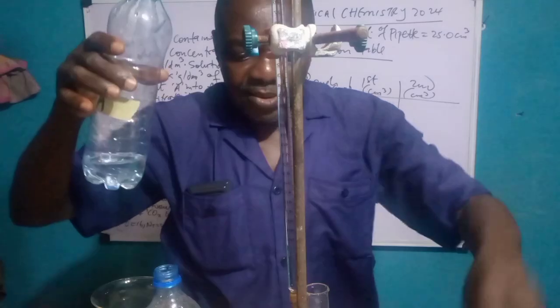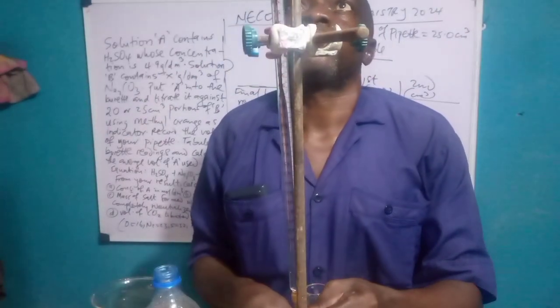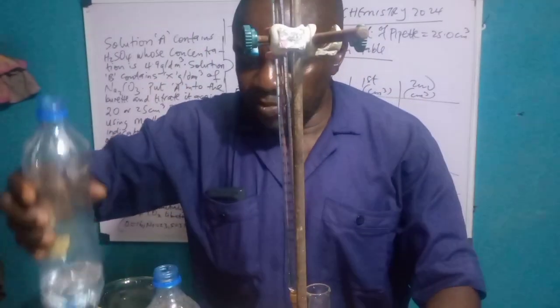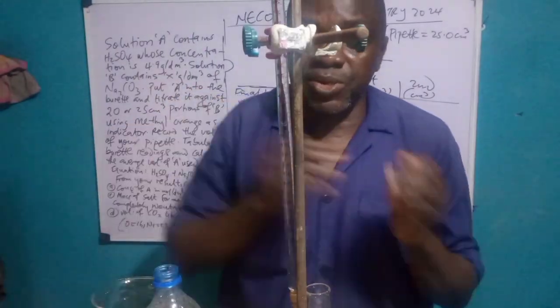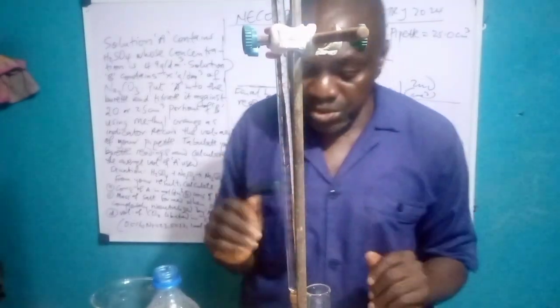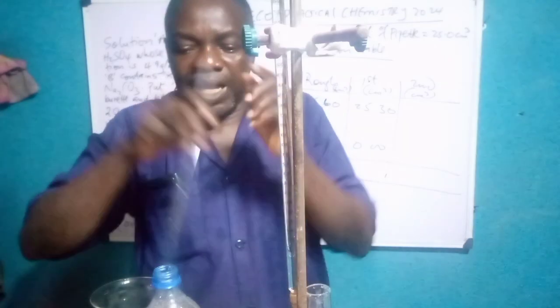Once it exceeds 50, you cannot use 2 separate burettes to get accurate results. It's over 0, so we have to reduce it to 0. Good. Remember, in this titration, you must remove air bubbles. When I did it, there was nothing like air bubbles. So check my previous video. Everything you need to know is accurately explained there.